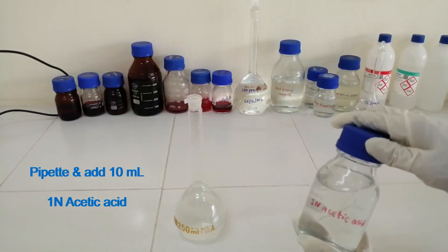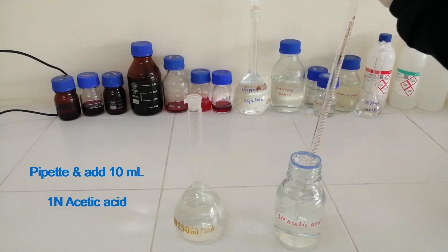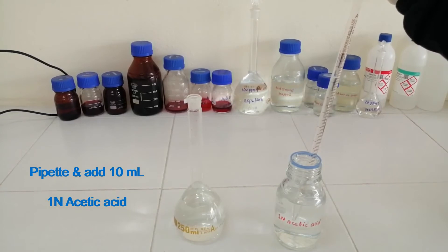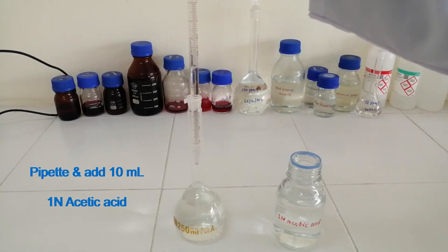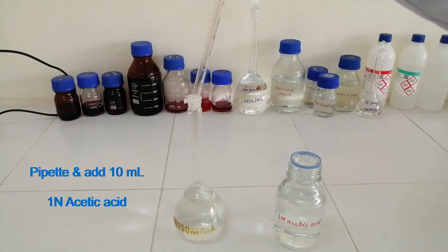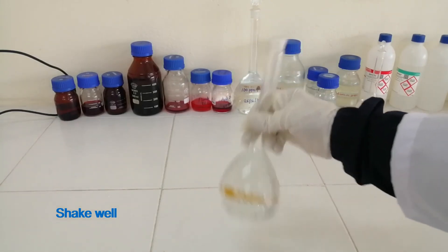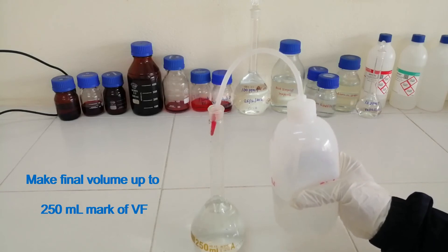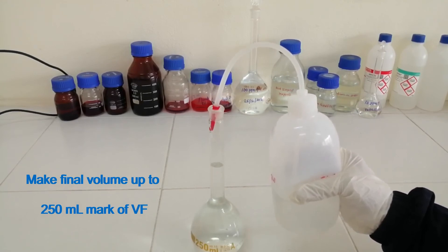Add the required 1N Acetic Acid solution. Make the final volume up to 250 ml in the volumetric flask. Shake well.